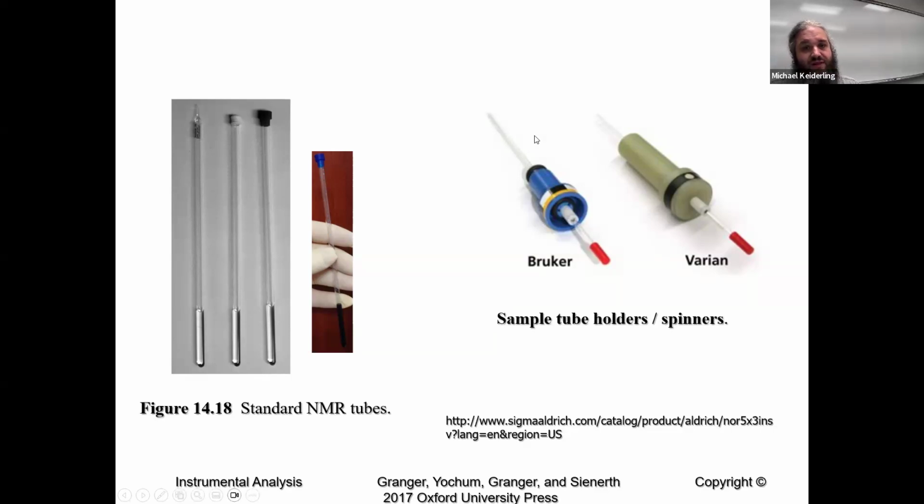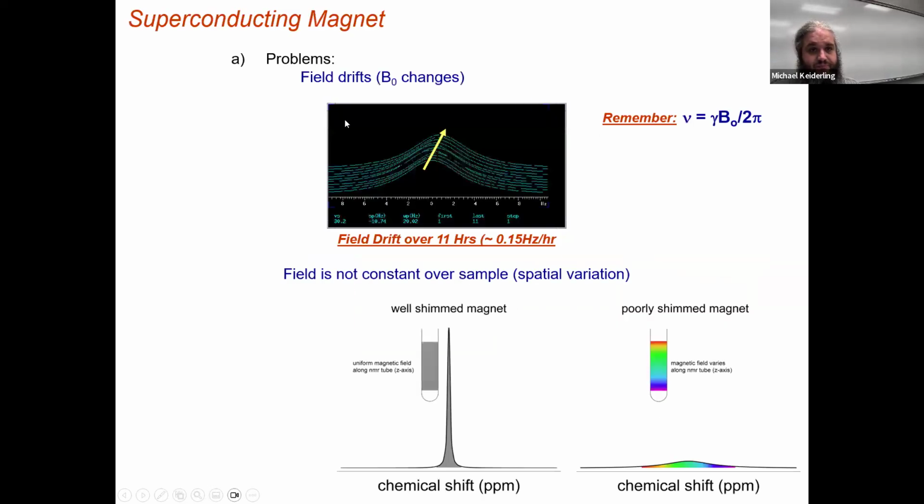So it helps eliminate any spot in the tube that's not mixed as well or has stronger concentration. It doesn't need to happen, but it can help. And this is especially true where you're dropping this tube far into the cold dewar.